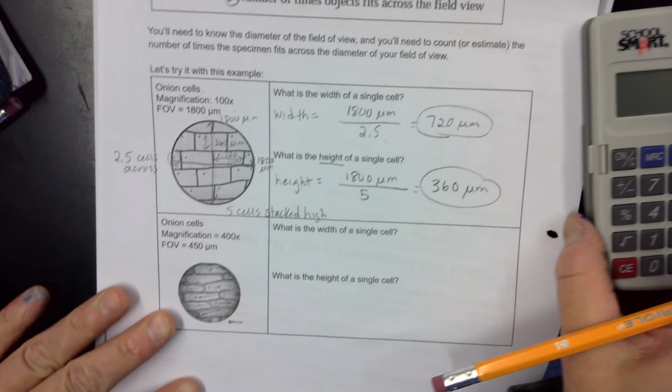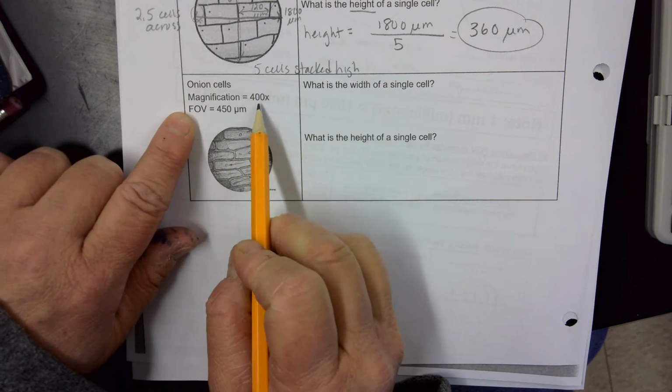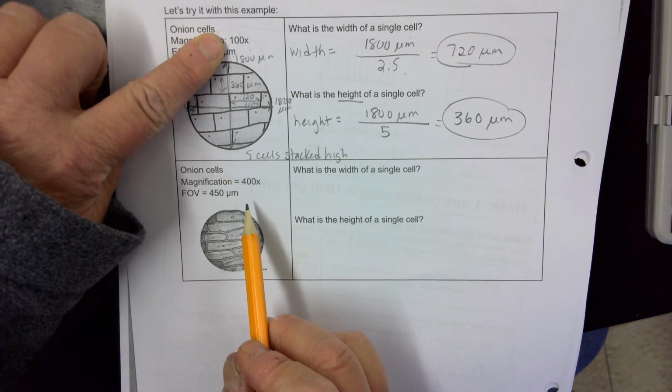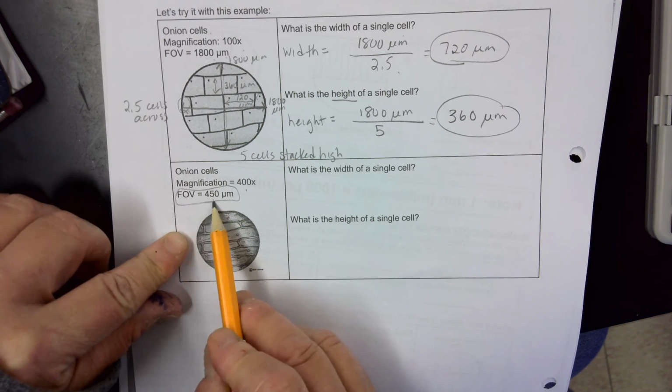All right, let's take a look at one more example, and then I'll show you which ones you can try. So now we have switched from medium power of 100x up to 400x, so our field of view is smaller. So take note of that field of view being a little bit different.